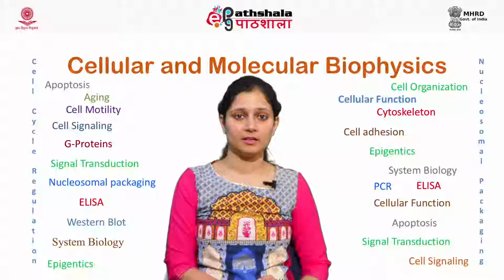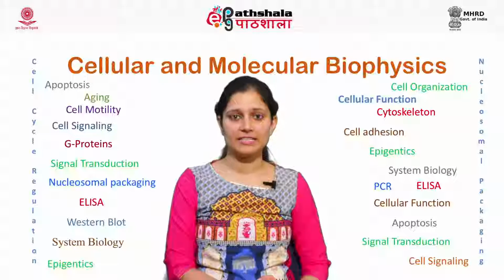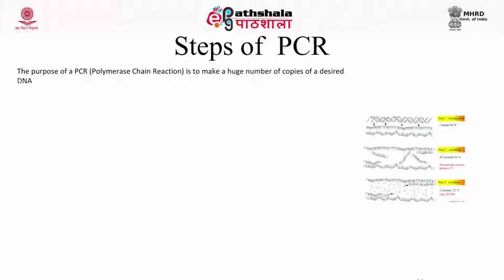Now let us learn the essential steps of PCR. There are 3 essential steps of PCR: denaturation, annealing, and extension. We will discuss all of these 3 in detail. The purpose of PCR, that is polymerase chain reaction, is to make a huge number of copies of a desired DNA. This is done in an automated cycler which can heat and cool the tubes with the reaction mixture in a very short time.